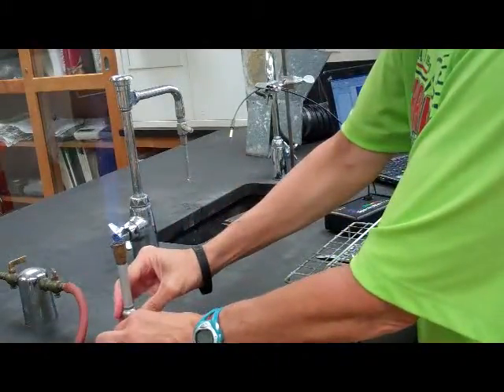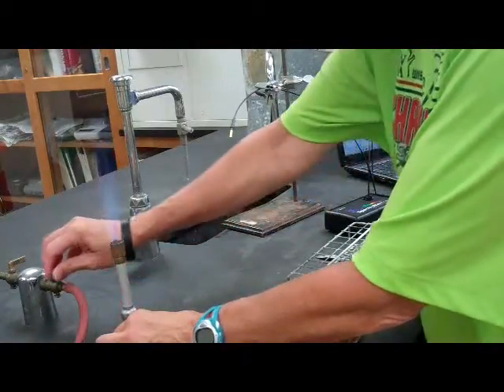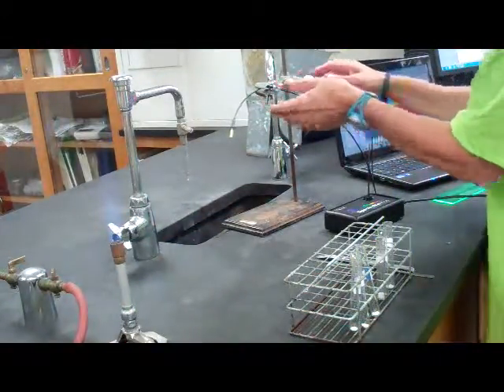You adjust that with the barrel and also with the needle valve and the gas valve too.